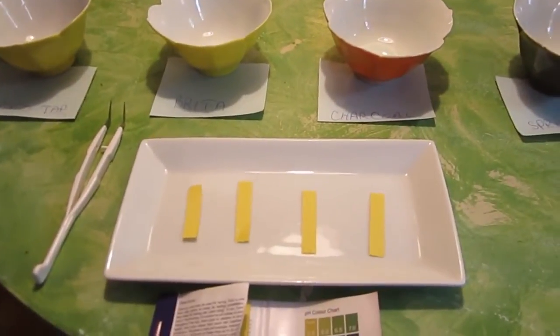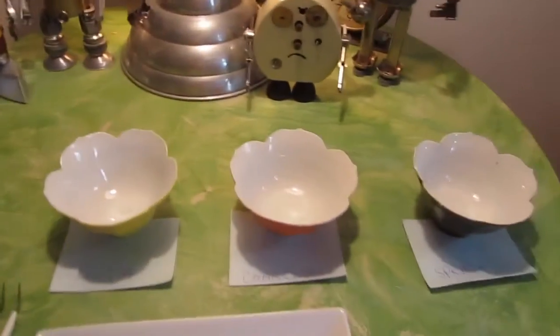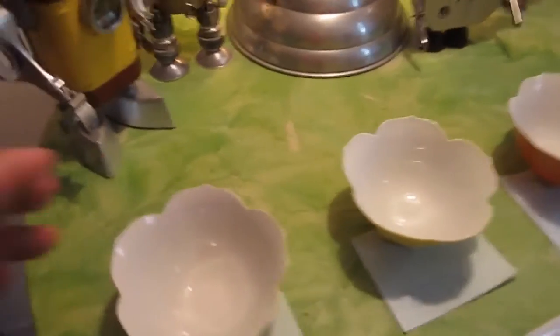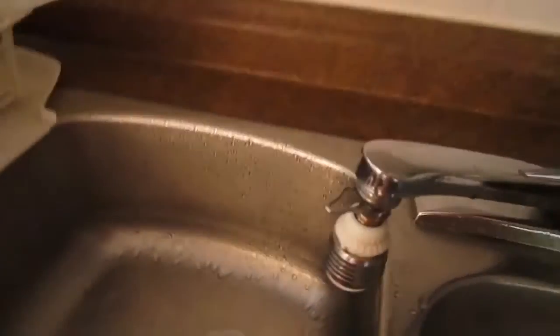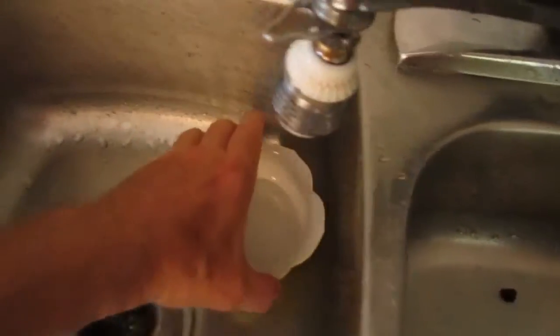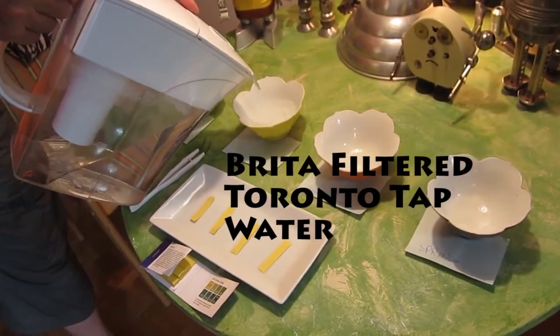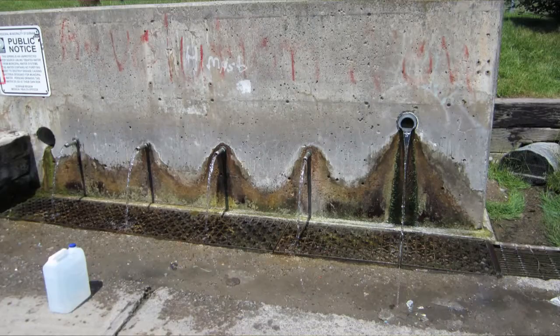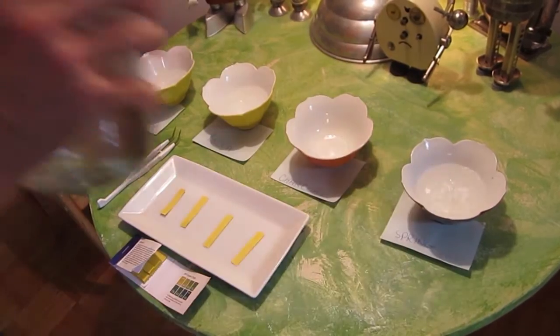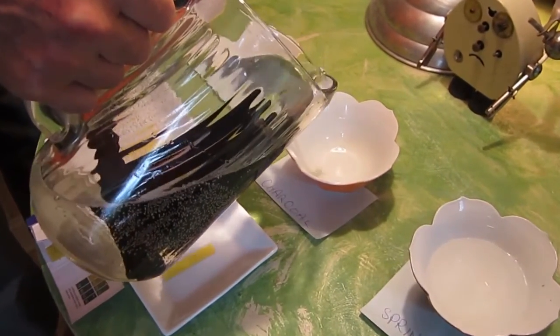So we have our pH measures here and we have our bowls. We're going to get some Toronto tap water and pour some Brita in here. This is spring water north of Toronto, and this is water that has had charcoal sitting in it for about 12 hours.